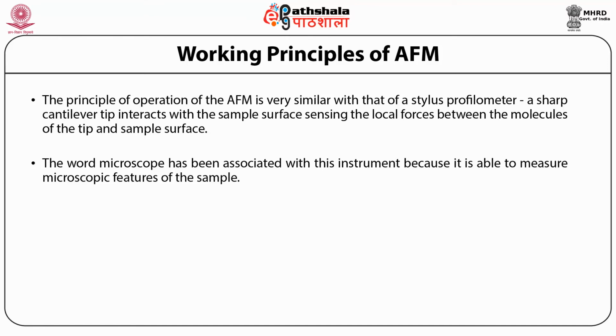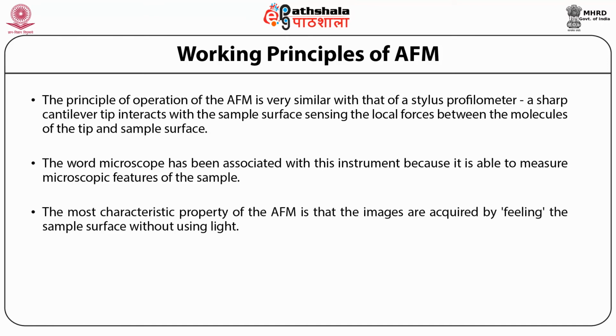The most characteristic property of the AFM is that the images are acquired by feeling the sample surface without using light. In this way, not only can the sample topography be recorded with good resolution, but also the material characteristics and the strength of interaction between the sample surface and the cantilever tip.